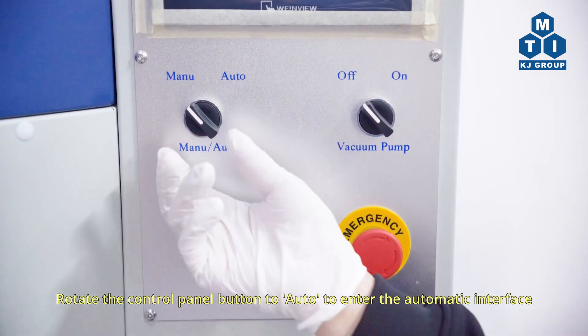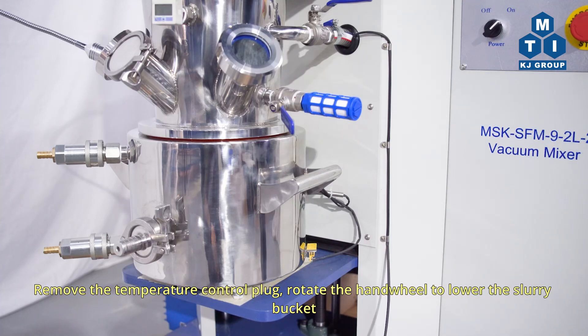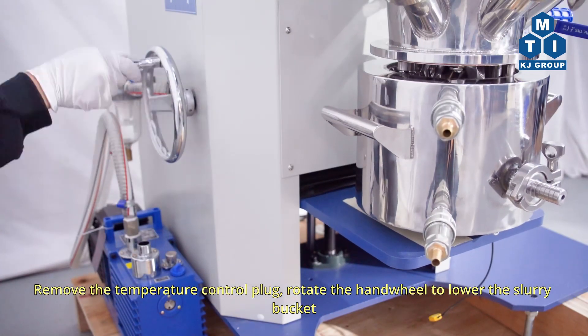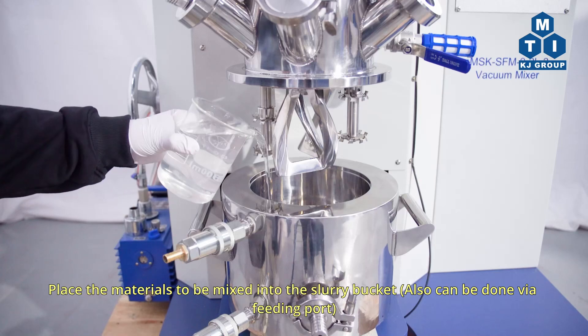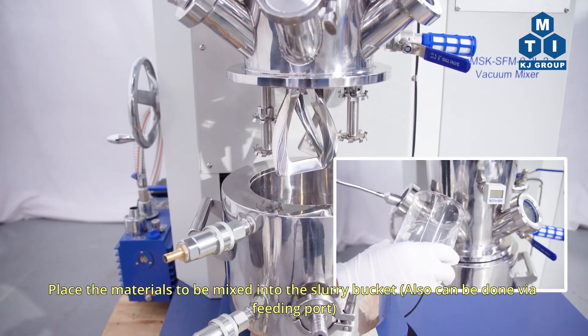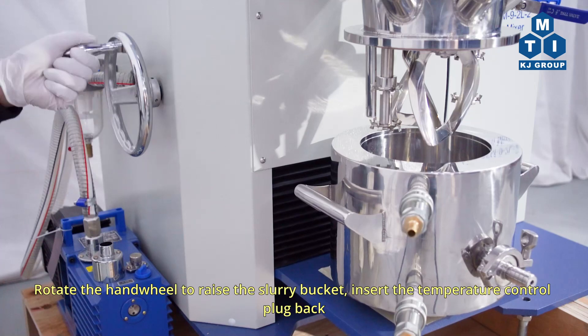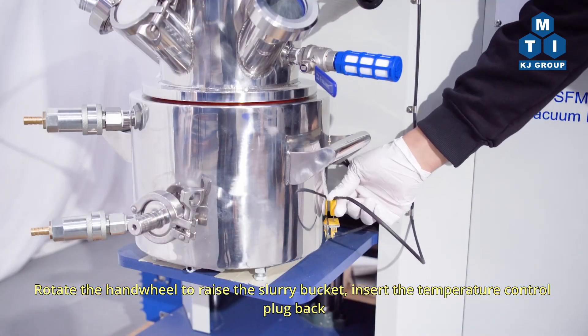Rotate the control panel button to Auto to enter the automatic interface. Remove the temperature control plug and rotate the handwheel to lower the slurry bucket. Place the materials to be mixed into the slurry bucket — this can also be done via the feeding port. Rotate the handwheel to raise the slurry bucket, then insert the temperature control plug back.